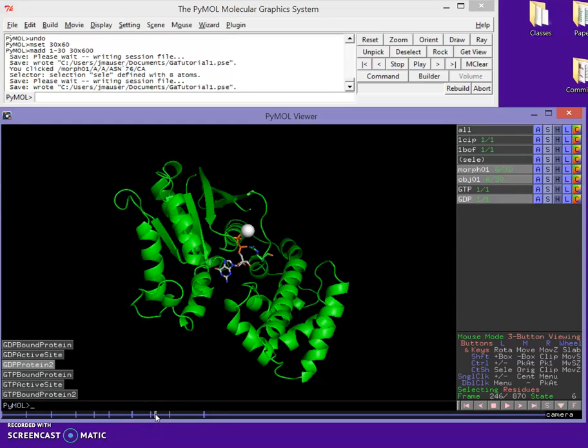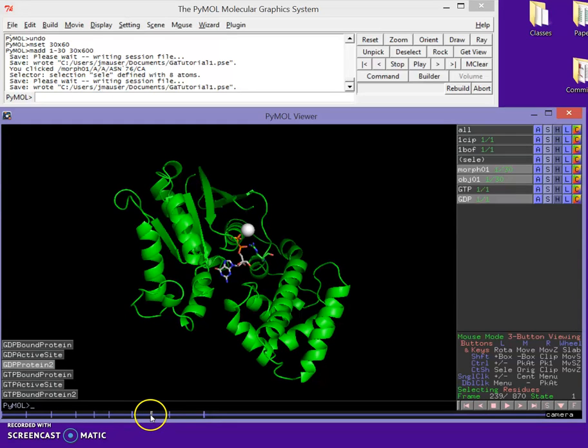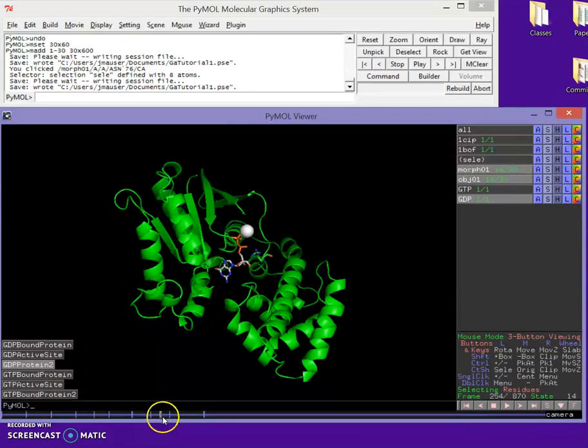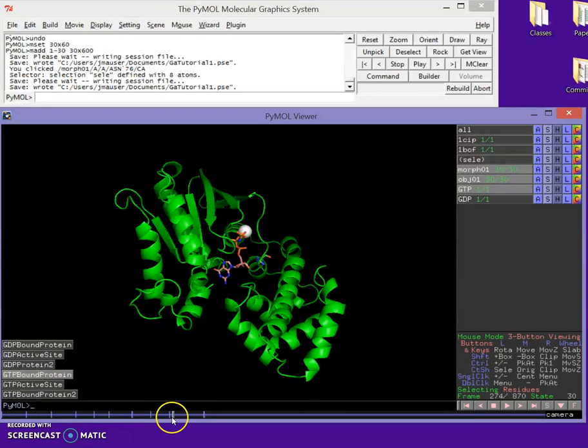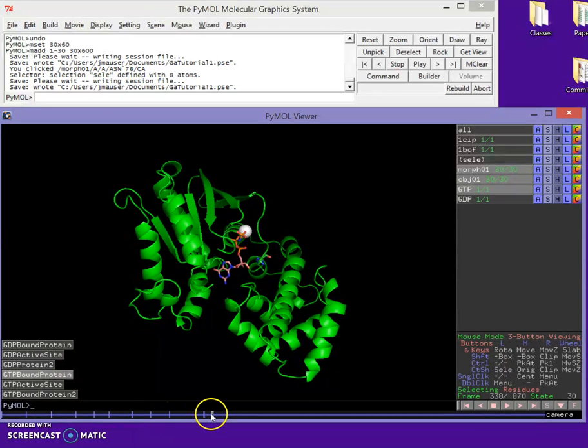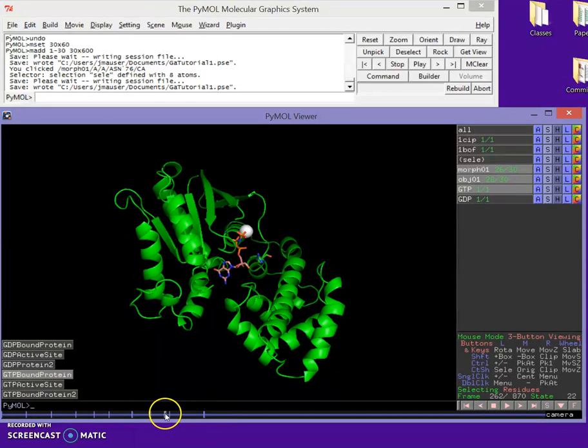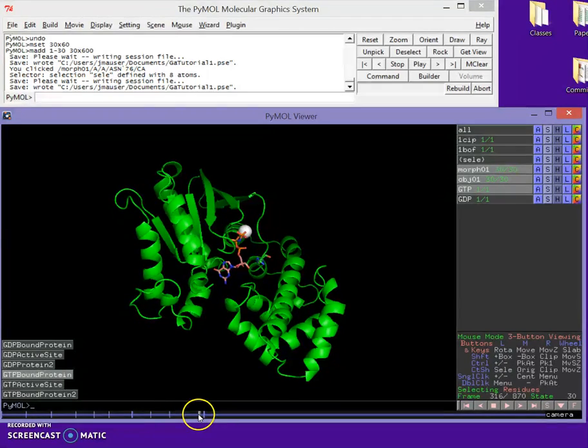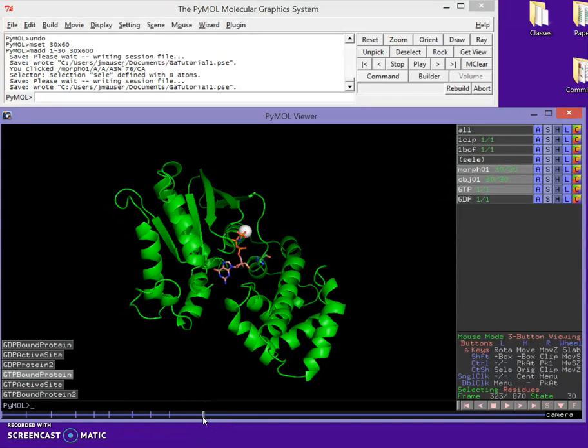All right, welcome back guys. What we've just done is perfect our morph and our switch for ligand, and now we have essentially done a hold for the whole protein.